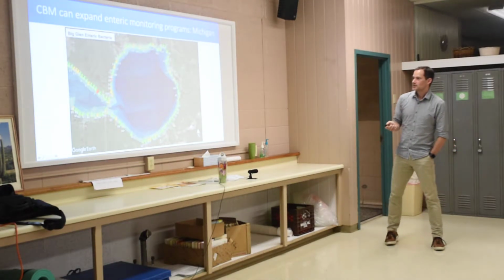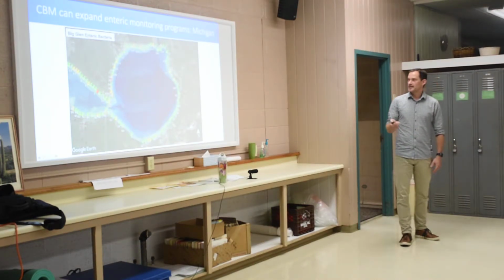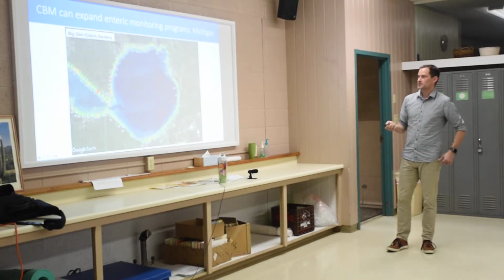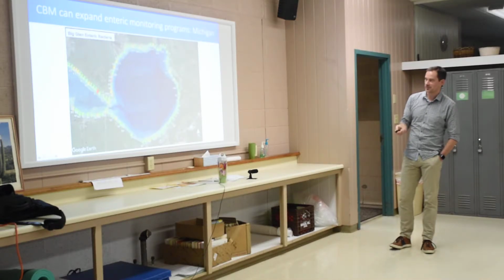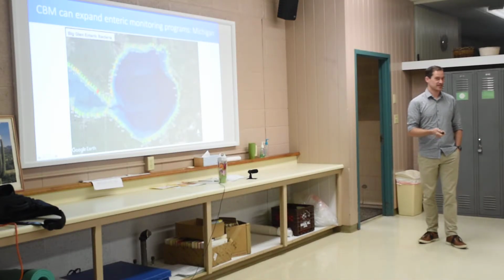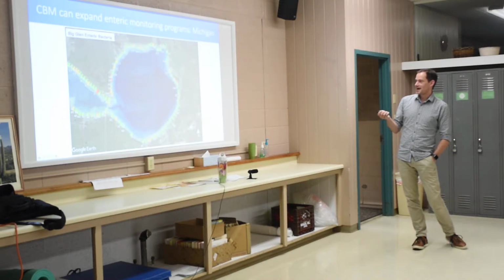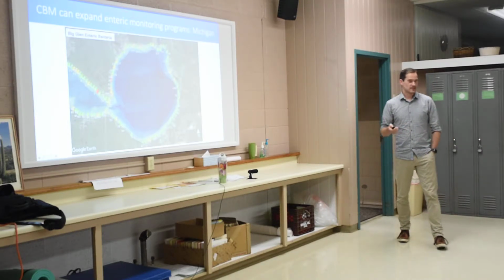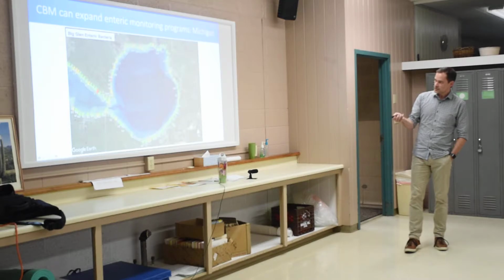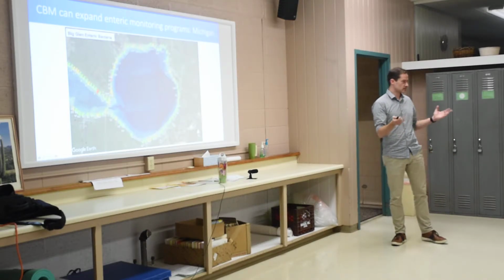So we do have some enteric studies that we've started. And this is data from Glen Lake, where we did an HF183 study, which is a human marker. And we just showed, we sampled, well, Ron and Freshwater Solutions and his team sampled a ridiculous number of sample sites around Glen Lake, okay? This is 146 samples that were taken around Glen Lake. So you have very, very good resolution here. This is a single time point, but you can see there are some places where we see some human marker in Glen Lake, which is totally not unexpected.